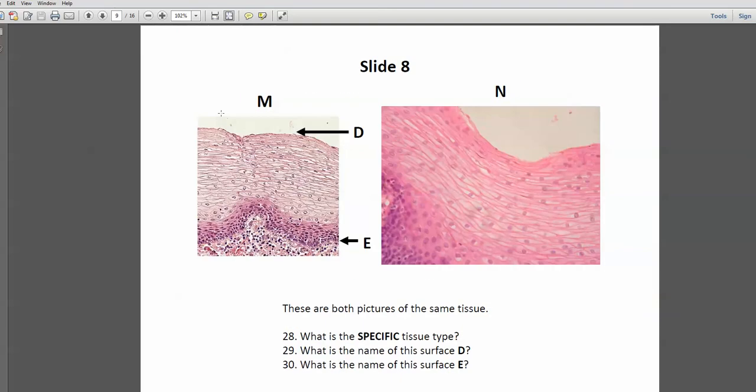Number 8. We have a free space. We have cells forming sheets. You can see bunches and bunches of nuclei. So we know this is epithelial. Now we need to identify whether it's stratified or simple, and obviously there are multiple layers, so it's stratified. And now we have to identify shape, and obviously at the apical surface the cells are flat. So this is stratified squamous epithelial.